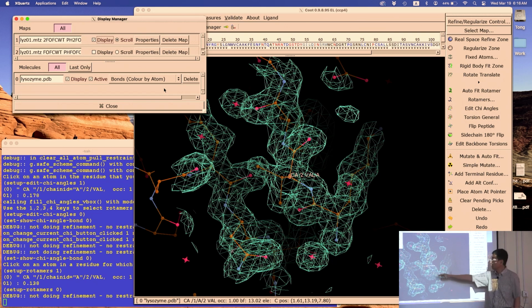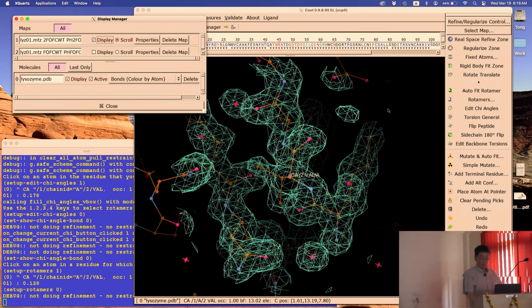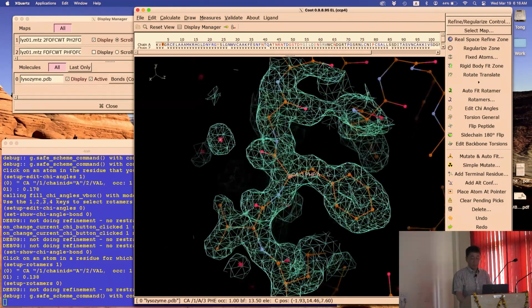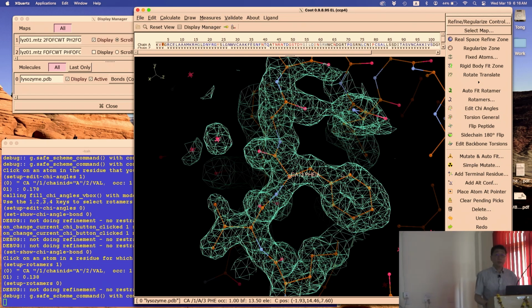So here we are. We're still on residue 2. Let's do one more dragging and then we're done. Okay? So spacebar again. You're residue 3. Are you a residue 3? Phenylalanine.